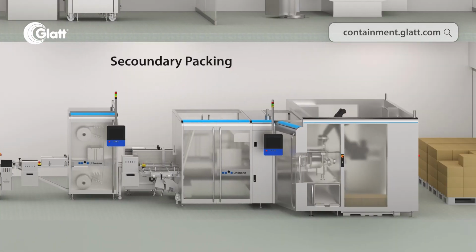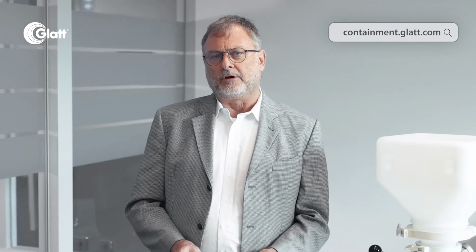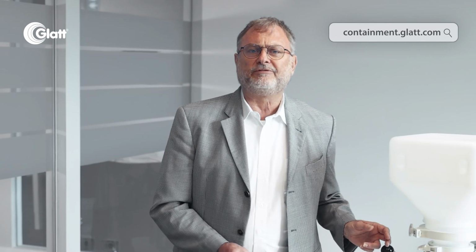In this example, which shows the entire process sequence in an OSD factory, from the weighing of the input materials to the blistering of the tablets, not all process steps are equally sensitive in terms of contamination. There are critical interfaces that require special attention. For example, the weighing of the active ingredient is more delicate than that of the excipients, and the handling of the final ground starting materials is more critical than that of the coated tablets or the blisters. This looks quite obvious and can also be seen immediately.